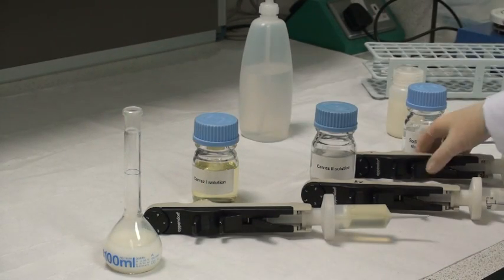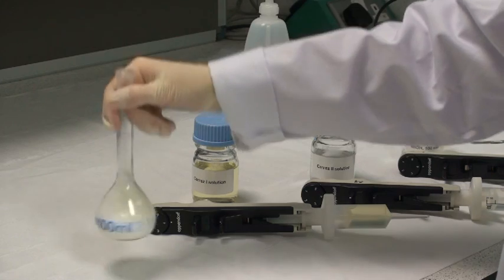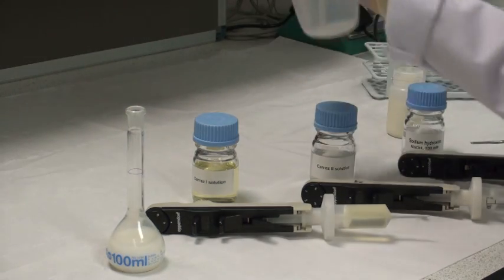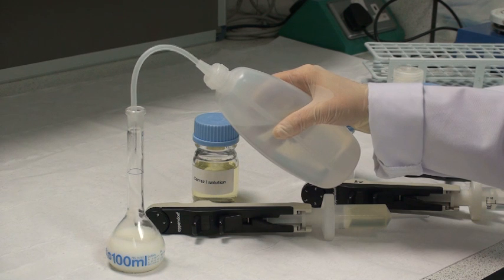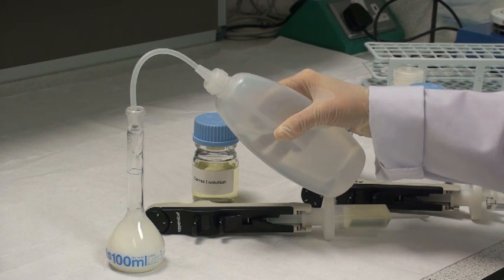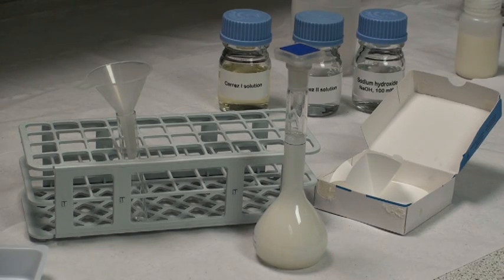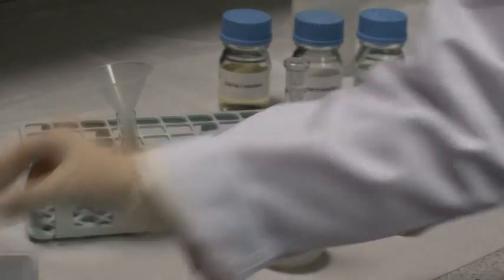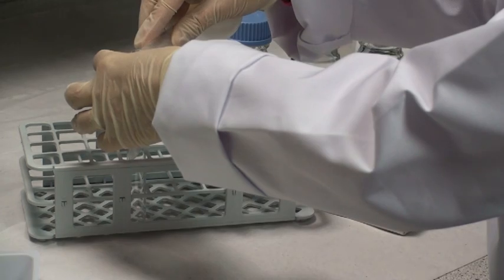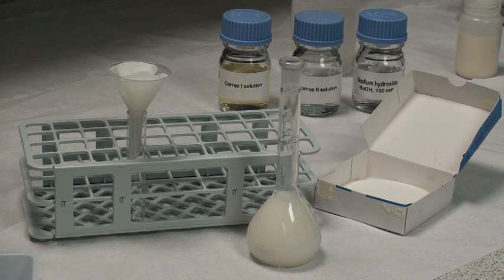Then add 2 mLs of Carrez 2 solution and again mix the contents thoroughly. Finally, add 4 mLs of sodium hydroxide solution at 100 millimolar. Make the contents of the volumetric flask up to volume using distilled water from a wash bottle. Filter the solution through Whatman No. 1 filter paper and use the filtrate, which may still be very slightly hazy, in the assay.